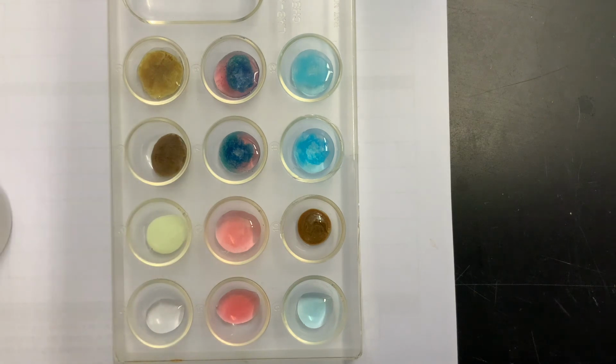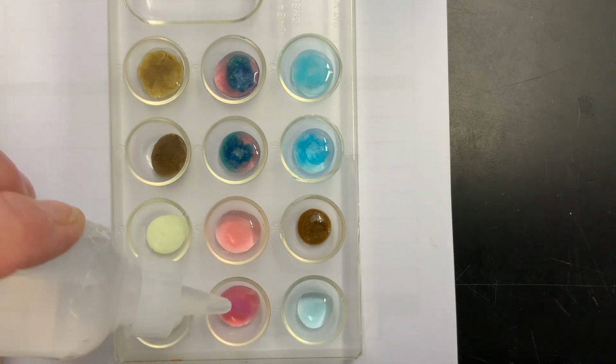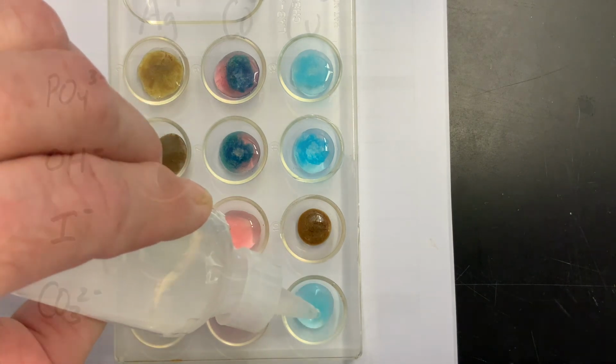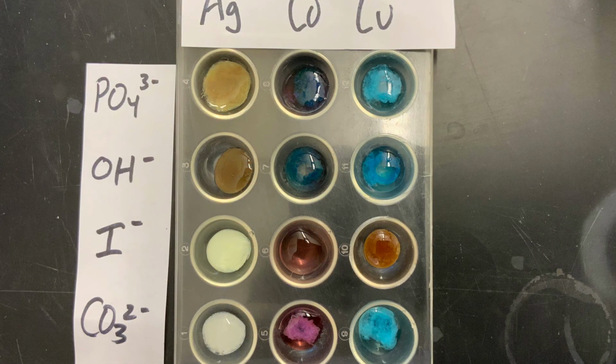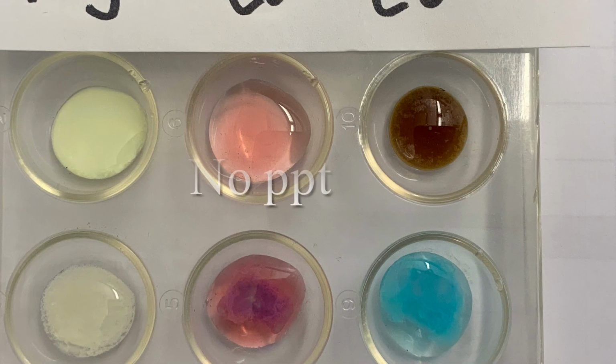And lastly, carbonate ions added into silver, producing a white precipitate, into cobalt, producing a pink purple, and lastly into the copper, producing another blue precipitate. Be sure and pause the video if necessary to record data, sometimes a better view with a black background, and now a close-up view of the phosphate and hydroxide rows, and now finish off with a close-up view of the iodide and carbonate rows.